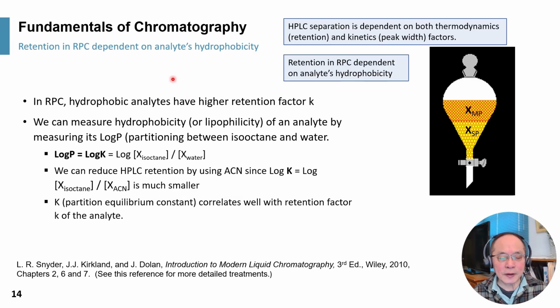So once again, to follow up with our discussion, the HPLC separation is dependent on both thermodynamics, from the equilibrium constant of the partitioning, which is responsible for the retention, and the kinetics, where we have in-column and extra-column broadening or peak width.